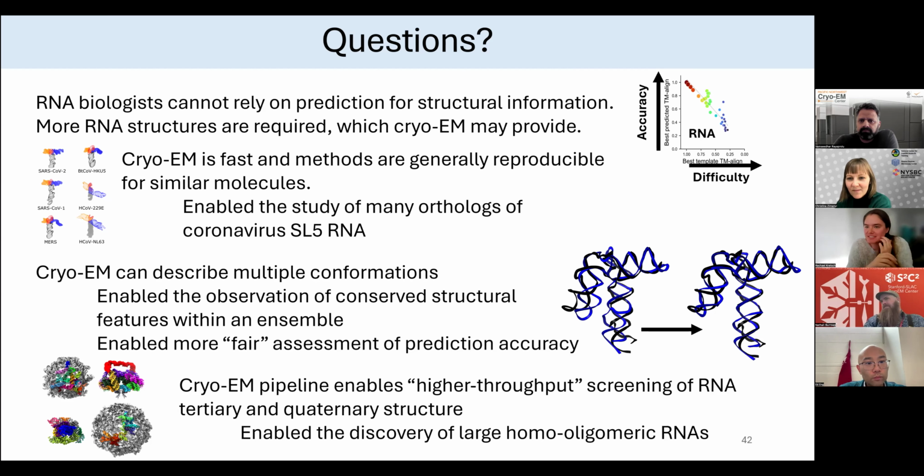Yes. So there's a very interesting effect with base pairs. At roughly 3.5 angstrom resolution, you start to see, if you're below 3.5, your bases are just all blurred out. Once you get just slightly above that, you have beautiful base separation. And you see essentially a very steep trend with the quality of your RNA model when you go between those resolutions.